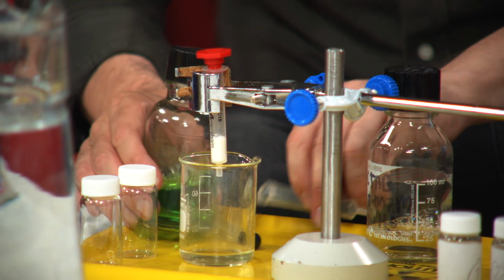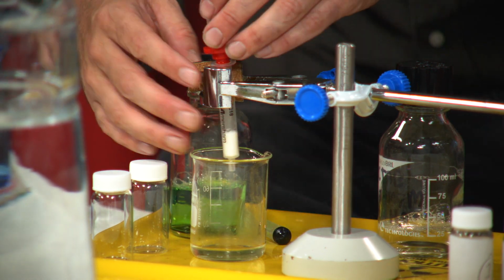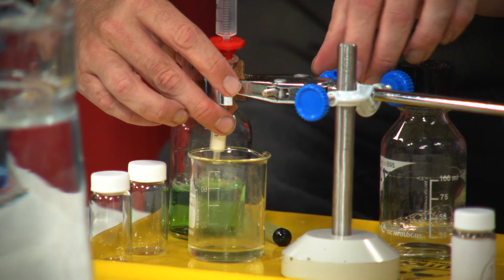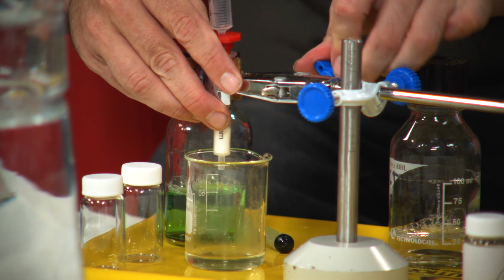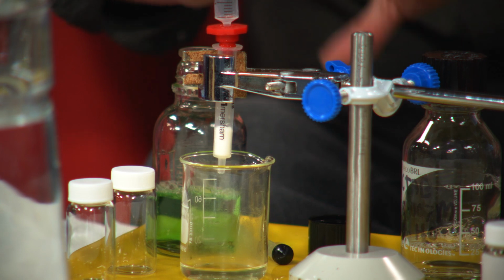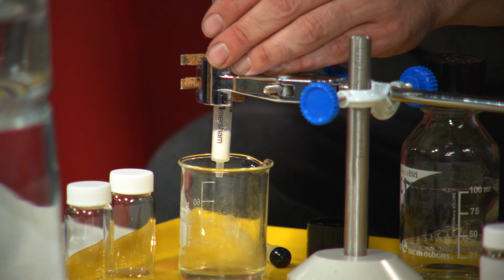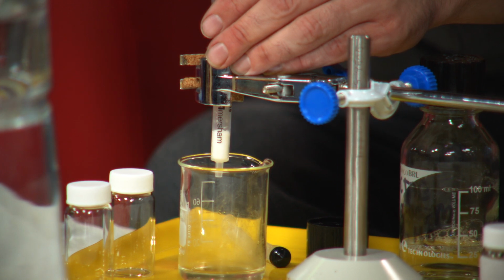Okay. And that's a mixture of two different food colours. And so I'll just do the same with that. Let's get a bit better clamped. Feels a bit loose. And 3 mils of that. And what we're doing in the first step is just trying to concentrate that onto the top of the column such that the separation is more effective. So 3 mils of food colouring, approximately. And then press down again.